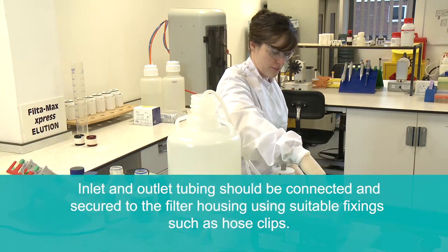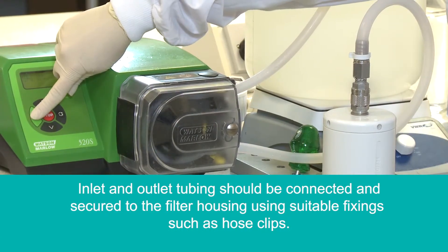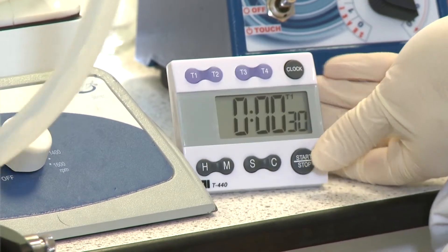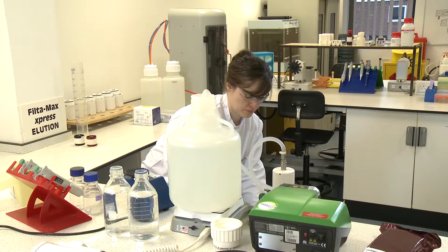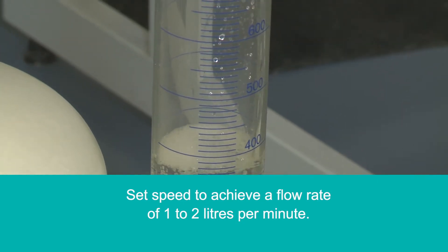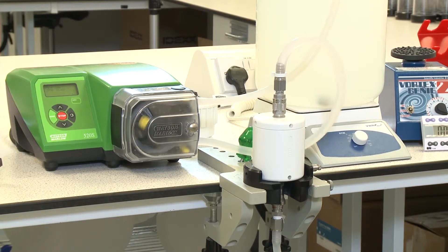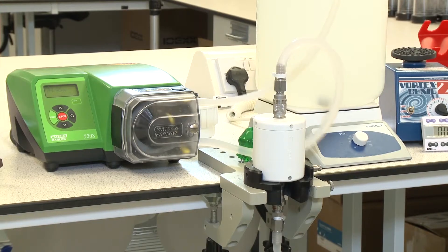Attach the tubing to the filter housing and ensure hose clips are present and secure to prevent sample loss. Once the setup is complete, perform a system check by filtering the sample for 30 seconds. During this time inspect for any leaks and measure the flow rate. Adjust the pump settings as required to achieve a flow rate of between 1 to 2 litres per minute. Note that alternative types of pump and tubing may be used but should be assessed for suitability with the system.